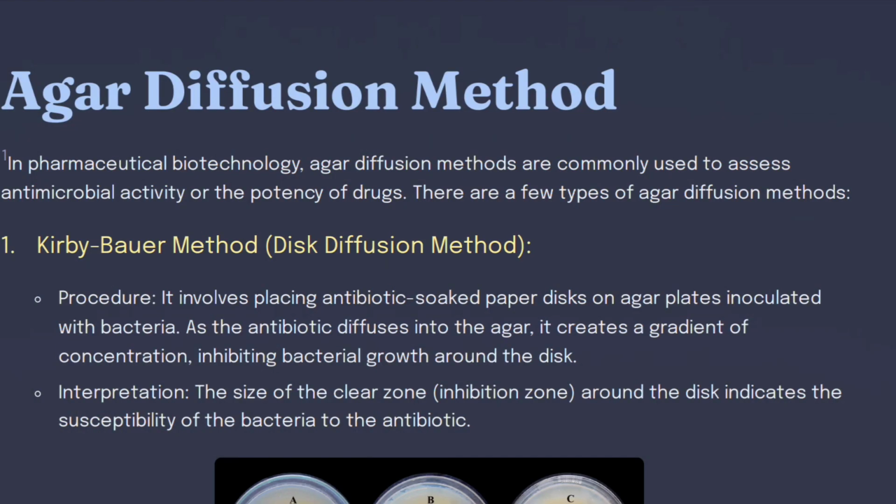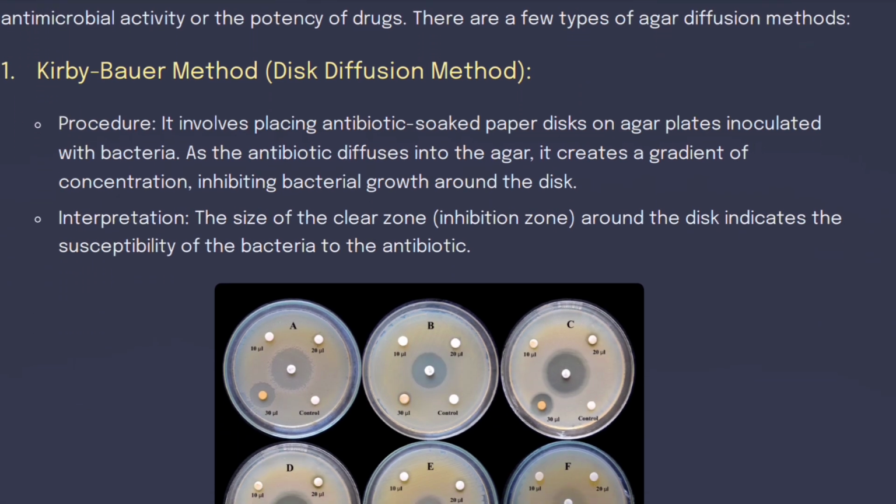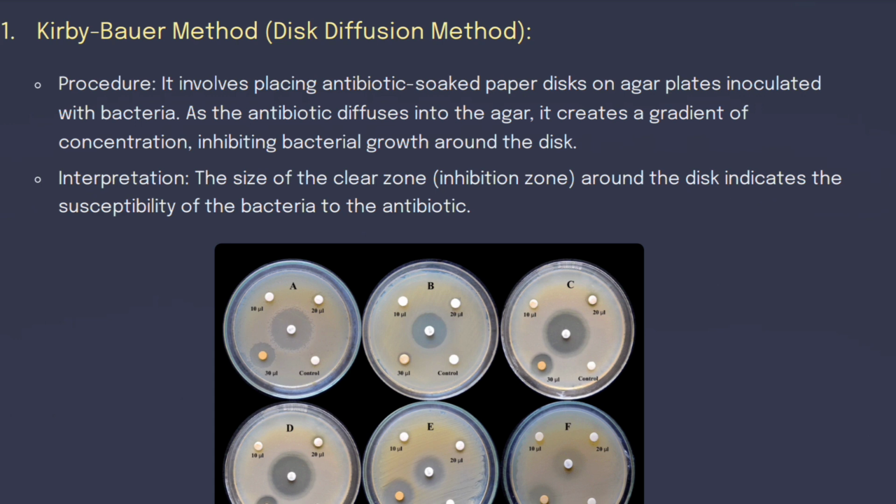In pharmaceutical biotechnology, agar diffusion methods are commonly used to assess antimicrobial activity or the potency of drugs. There are a few types of agar diffusion methods. 1. Kirby-Bauer method, disc diffusion method.